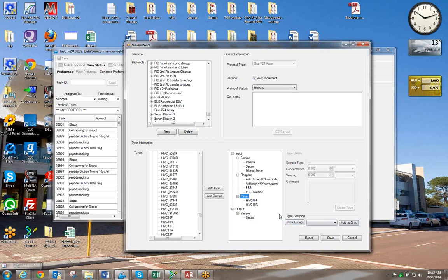I have to create a new group here. So go into the primers, create a new group, and then another new group. So it creates group 1 and group 2. And now you choose that and add that to group 1. And this one, add to group 2.